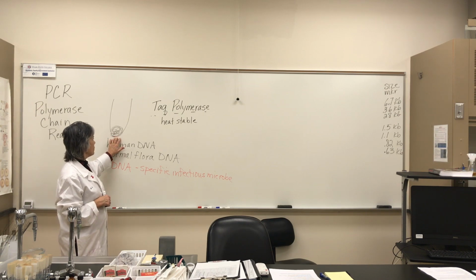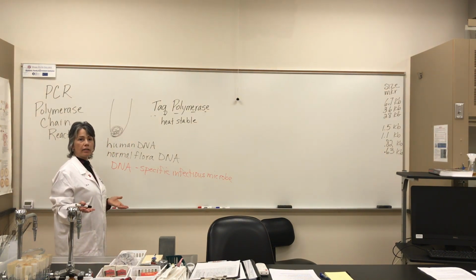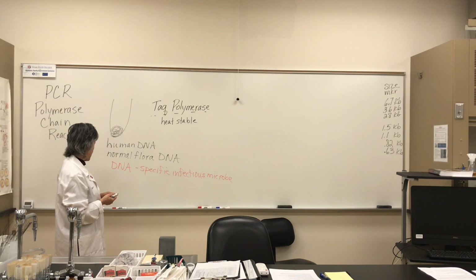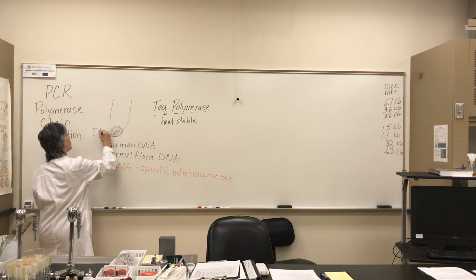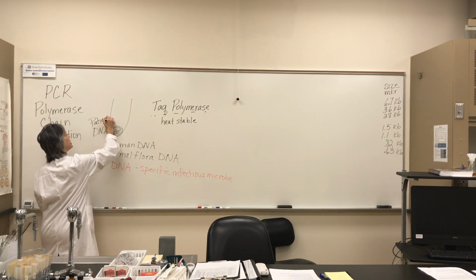All right. So if we start with a patient sample, now I talked about cheek cells because it's a little less disgusting, but in our case, in our simulated experiment, fecal samples. You can take a little bit of a fecal sample, do a DNA prep on it, and isolate DNA. So we need a patient DNA sample.